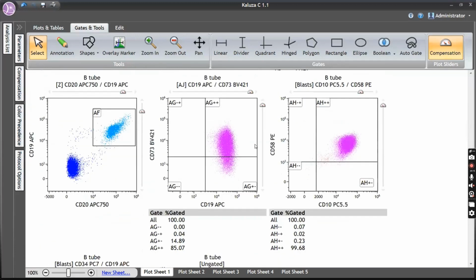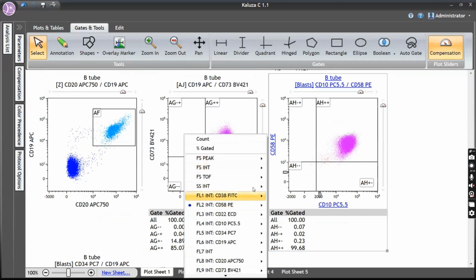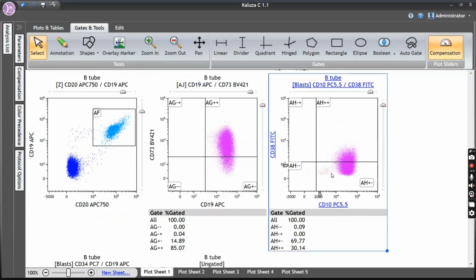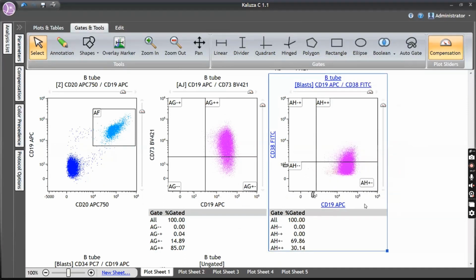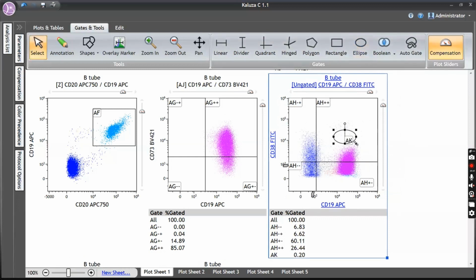Let me introduce you to the MRD markers. Hematogones will always be CD38 moderate positive. Here the blast is negative for CD38. Correct? The blasts are negative for CD38. If it is hematogones, I'll tell you where the population will fall. This is plasma cells. The hematogones will fall in this area. That is a normal location for hematogones. Whereas here, the abnormal B lymphoid precursors are CD38 downregulated. They have lost CD38, which is an LAIP, a leukemia-associated immunophenotype. So this can't be hematogones.